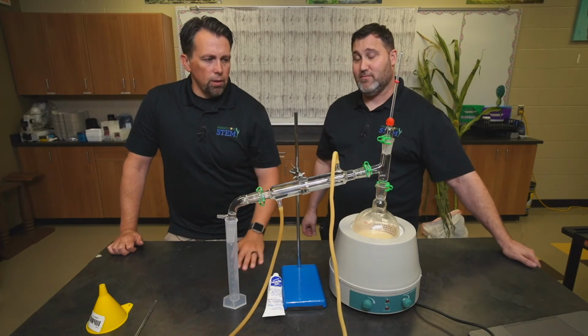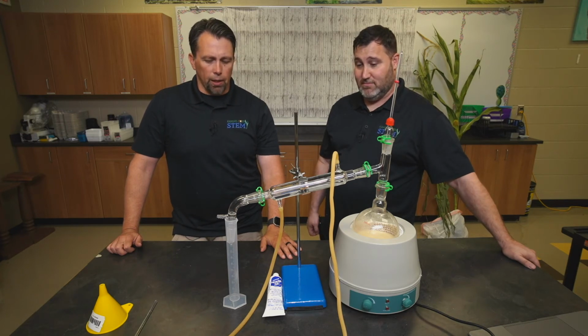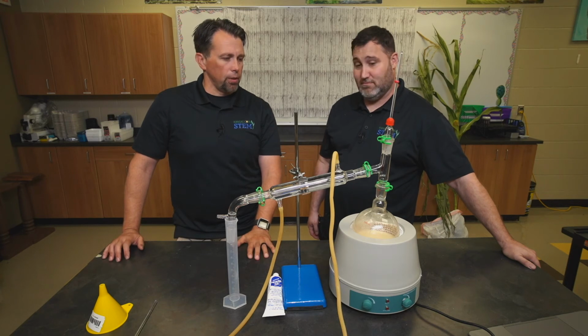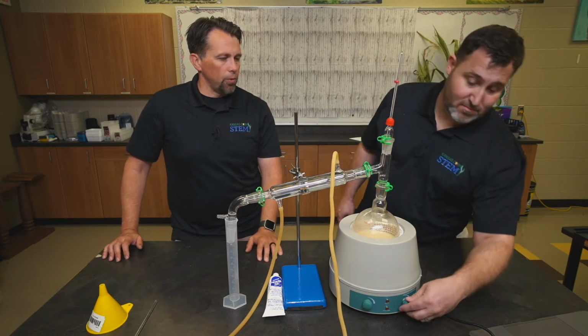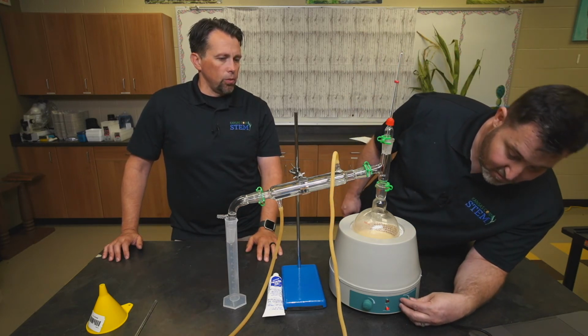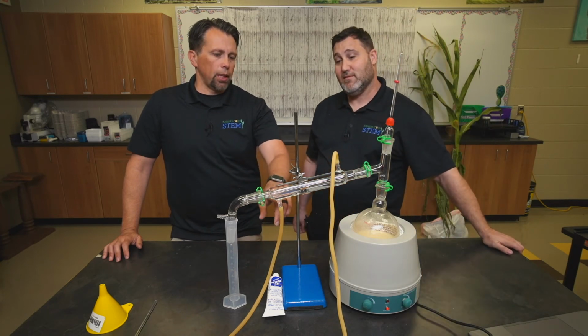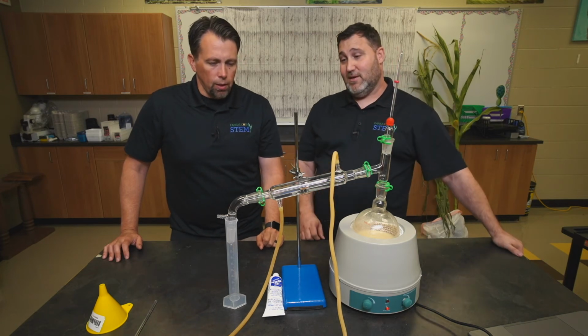So we have our distillation apparatus set up here. In the high school gas collection, we estimated we need to collect about 20 milliliters of distillate. So we're going to turn it on. Is it warming up over there? Water is running through our condenser, and we want that coming in from the bottom and out through the top so it stays full.